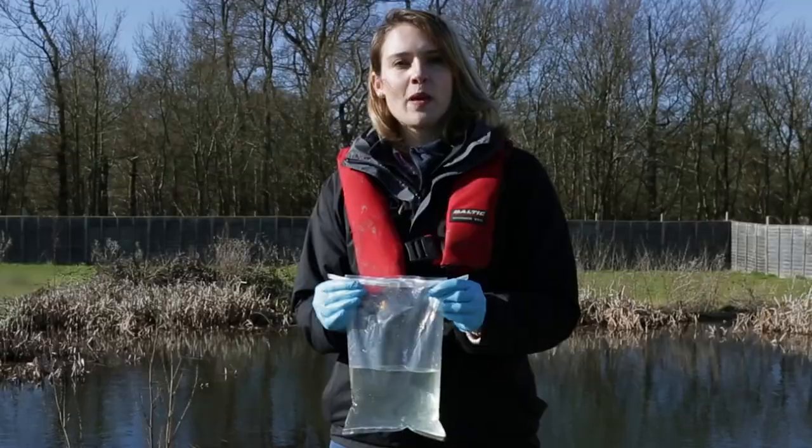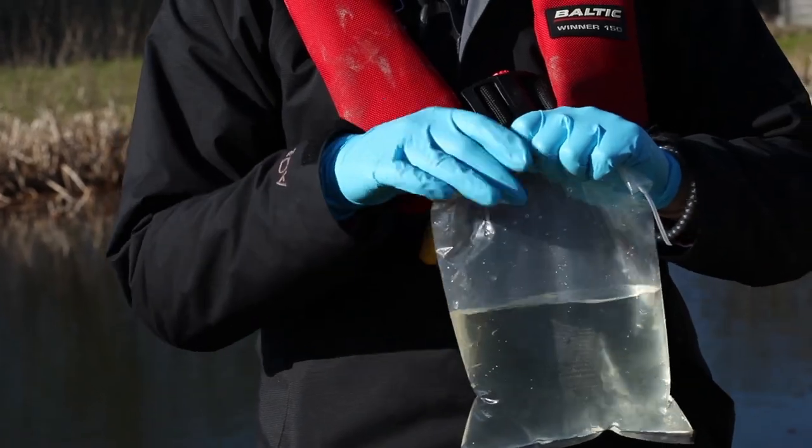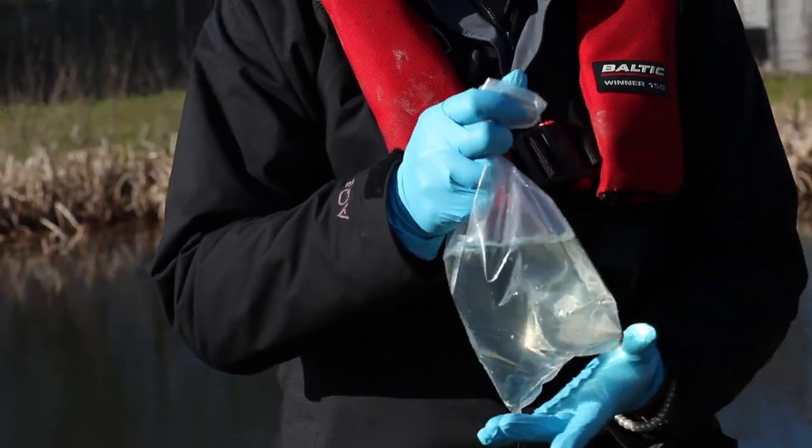Once you've taken your 20 water samples, fold down the top of the bag, tuck in the plastic tabs and vigorously shake for 10 seconds.